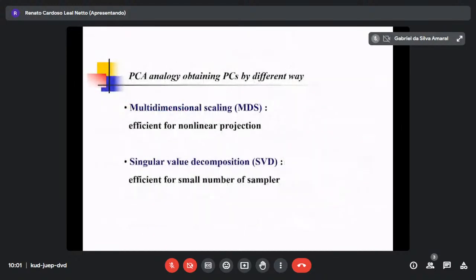Is this one, right? In this case, it's the variation of a principal component analysis. First one is your sample, the number of samples. It's very small, but I want to do proper correlation, proper separation. In that case, you can use singular value decomposition, SVD.